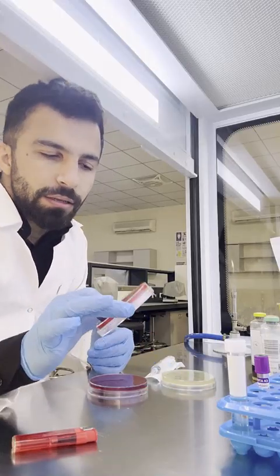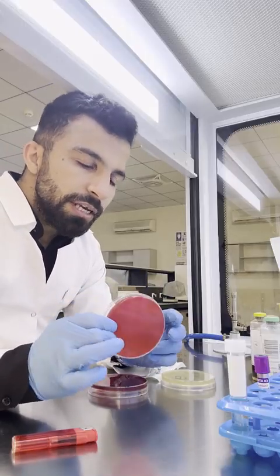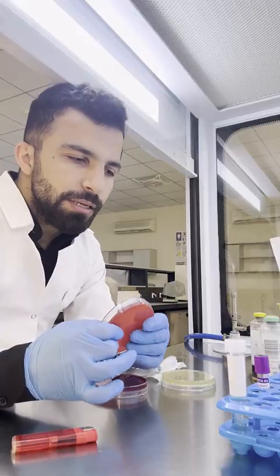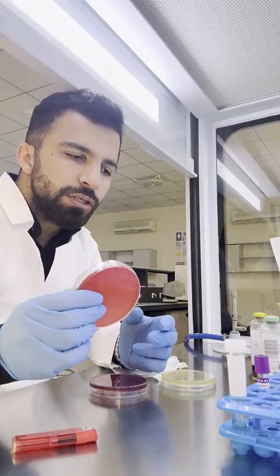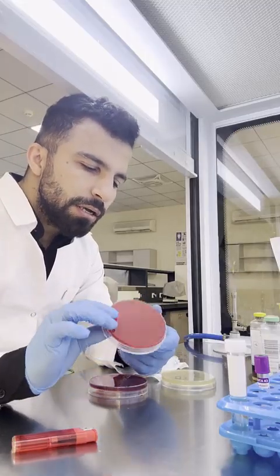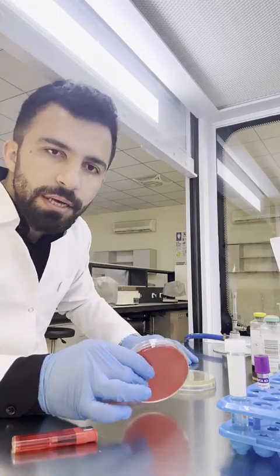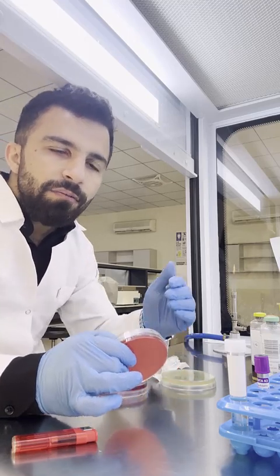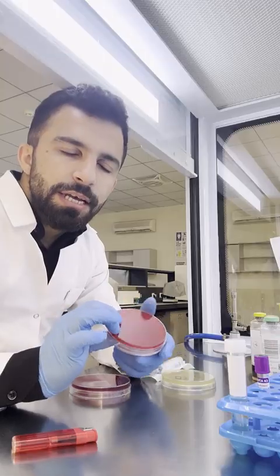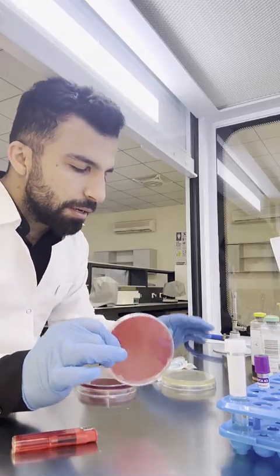And then we have the blood agar. Blood agar is used for fastidious organisms. Fastidious means the organism requires specific environmental conditions and special nutrients. It also shows red blood cell lysis, which determines the hemolysis. There will be three types: alpha, beta, and gamma. Alpha is partial hemolysis, beta is complete hemolysis, and gamma is non-hemolysis.